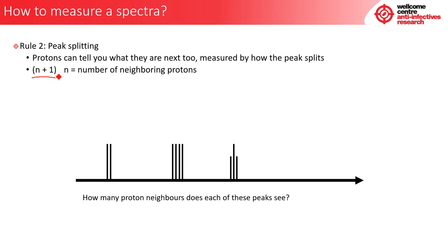I want to tell you just now that it is beyond the scope of this tutorial to explain the shapes of these peaks. For now, we are just discussing how peak splitting occurs. So let's take our first peak, for instance. Here we have 2. So after writing out the formula of N+1, and we say that it equals 2, again, look at this shocking drawing, that's my best I can do on this one, okay? We find out that N is actually equal to 1. So if this peak splits into 2, we know that the number of neighbouring protons that this proton can see is 1. And is this true? Yes, when we do look at it, it contains 1.